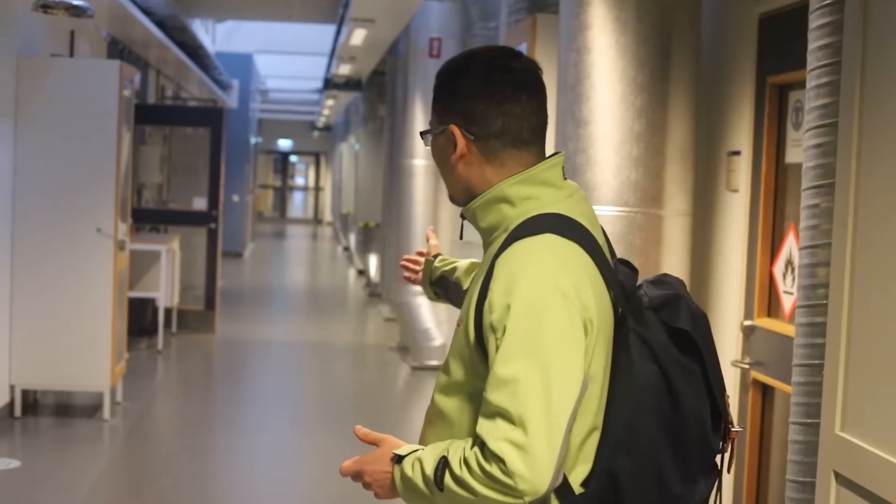So we reach the main corridor, and this corridor, as you can see, there are lots of labs associated to different research groups, and they are focusing on different topics: organic, inorganic, organometallic and analytical, polymer chemistry, and several other topics.